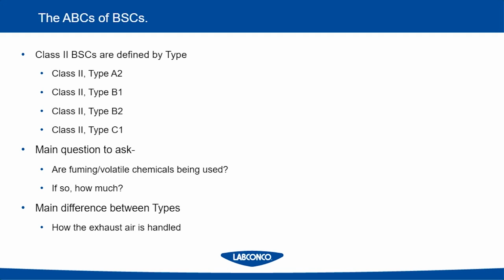One of the questions we get a lot at Labconco is there are all these different types of Class II BSCs. How do I know which one I need to use? First, I want to start out, before we dive into all these types and what's different, by saying all of these types are equally safe for all biohazards. What the difference is, and how you differentiate between these different types, is if you're a researcher going to be using any type of fuming or volatile chemical in your work.